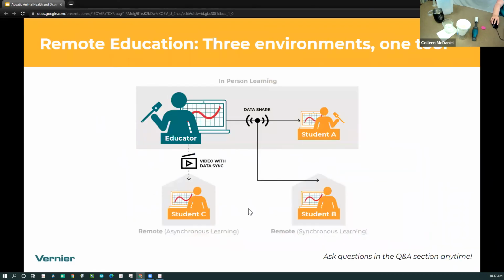Now, what I'd like to do is share this also with you. So what we're going to do is I'm going to activate Graphical Analysis Pro. So I'm going to unlock the feature set by using a code. And this is going to allow me to actually do some data sharing where I can share the data over the internet with you, and then you can do your own analysis of the data we've just collected.